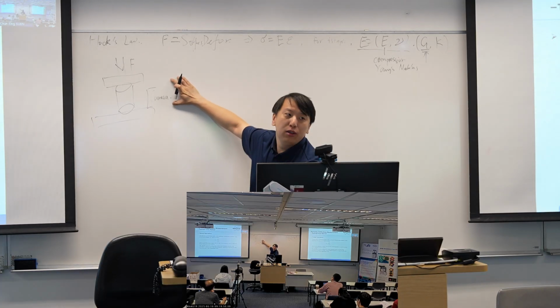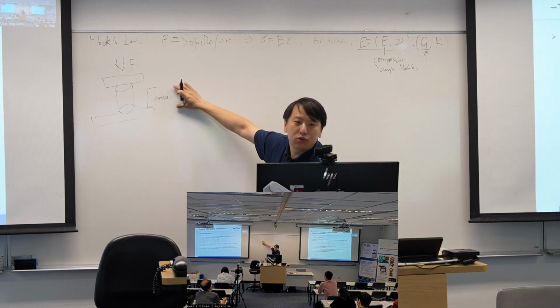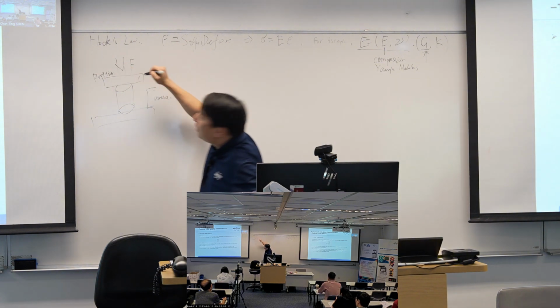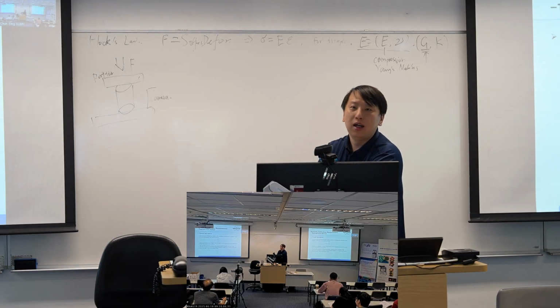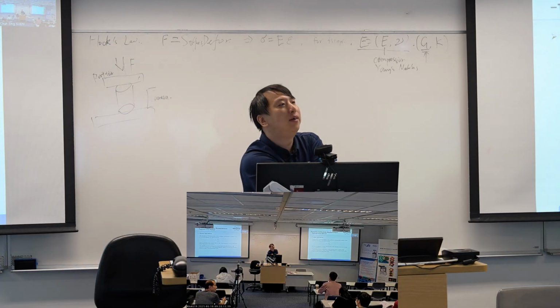Of course, nowadays there are many kinds of this instrument. You can use a camera to record, or you can use a position sensor on this stylus, and it records the displacement. If you are using a position sensor, it's almost the same as a nano indenter.